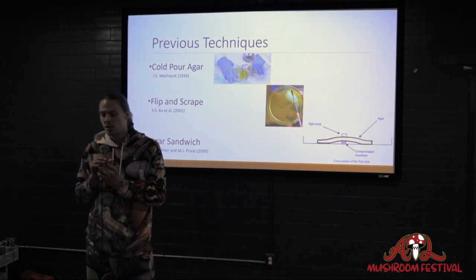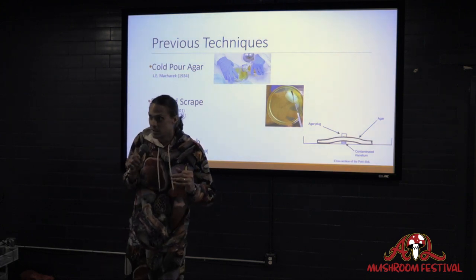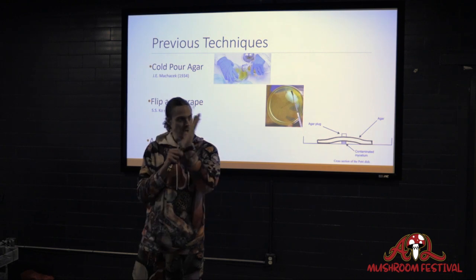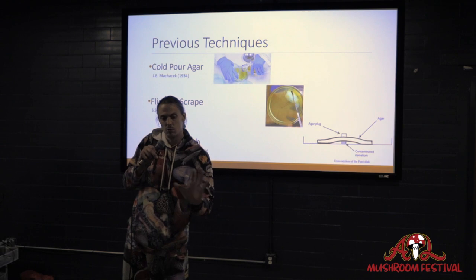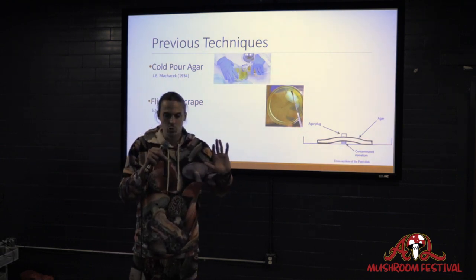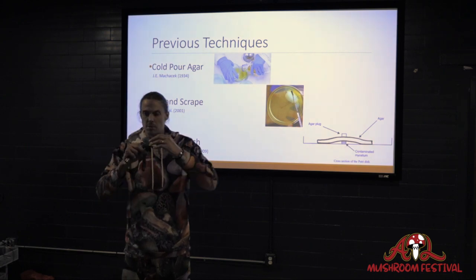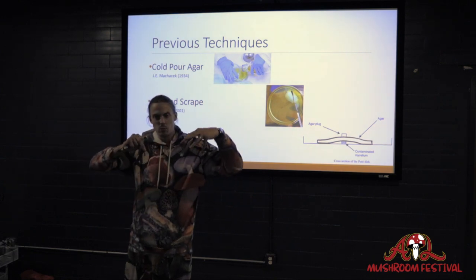And eventually you kind of develop a keen sense of color and texture, right? Because some fungal contaminants, they all may look white, but there's a gradient of white, a gradient of color. Some are more gray, some have maybe a tinge of green, like a hue to it. Some are pure pearly white, and maybe some cultures grow out more of like a tan. And so they all have their own look and feel. Some have very dense mycelia. Some have very wispy, kind of like cobweb mold. It's very stringy, wispy mycelia.